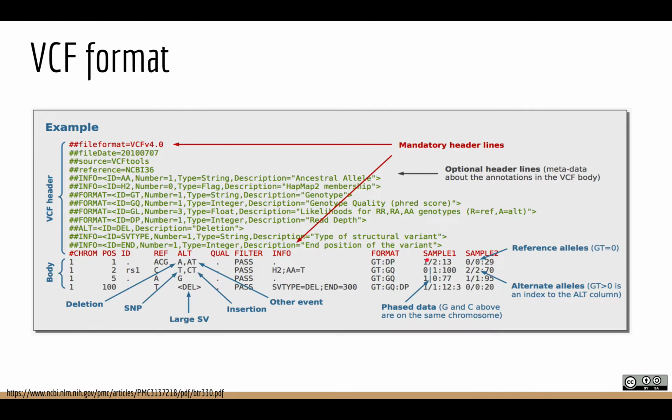And those were the 13 sequence alignments that went into figuring out the genotype for this sample. In contrast, sample 2 had 29 sequencing reads, so over twice the coverage. And so presumably the genotype associated with this sample is more confident than the genotype associated with the other sample because there's more sequencing data there. Okay?